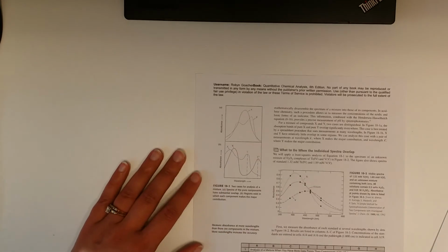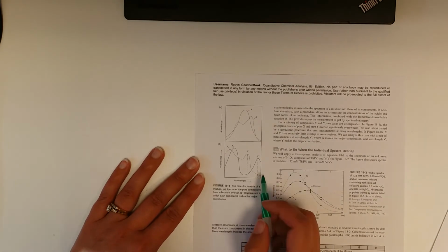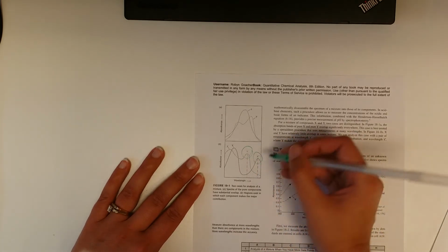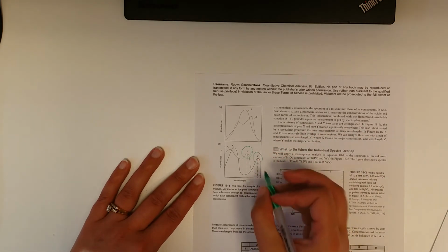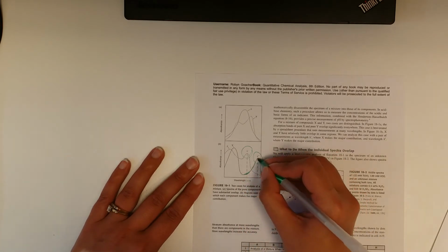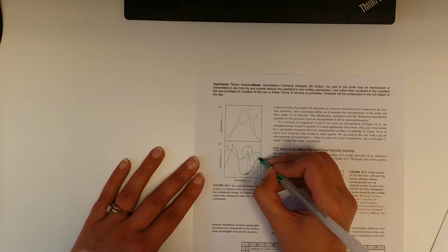Now, what happens if you don't have a nicely separated sample? What we just described was the bottom half of figure 18.1, where we have a region that's unique to one thing and a region that's unique to the other. Unique means, okay, this absorbs a little bit here, this dark line, but really it's mostly from that compound here. Over here, the absorbance is mostly from this compound.